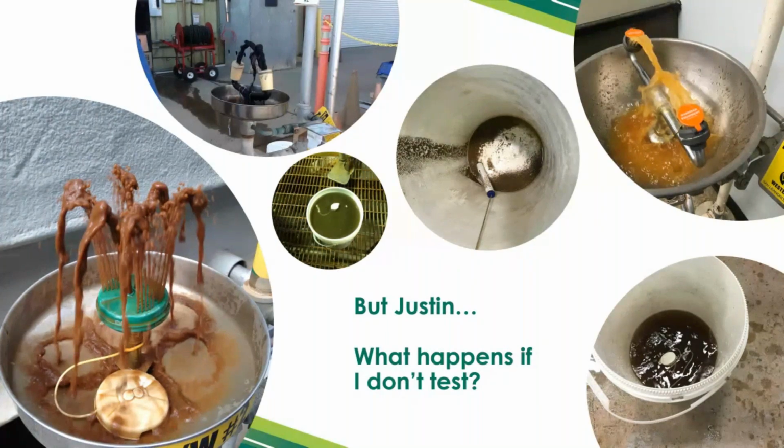You get your chocolate wedding fountains and Gatorade and every other color and flavor and taste. You do not want these spraying you in the eyes, or let alone entering your lacrimal punctum and nasal cavities, tear ducts, etc., and entering your lungs. This is not going to be helpful to your first aid needs. We need to ensure that these lines are getting cleared out. We're keeping the water nice and clear for first aid emergency use. And otherwise, this is potentially what we could be looking at.